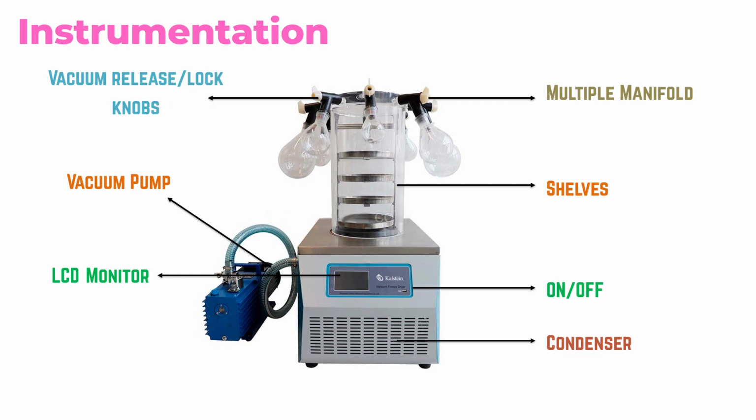Then the third step is the freezing step. We already discussed the freezing step: a deep-frozen sample is required to start the lyophilization process. So the desired freezing temperature is adjusted, the freezing is initiated, and the material is allowed to reach the target temperature in a uniform way.